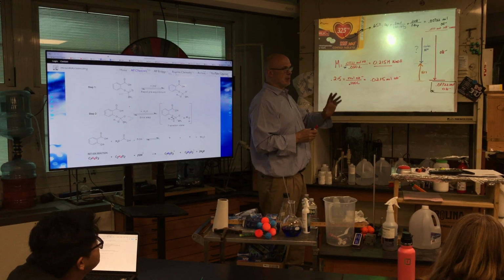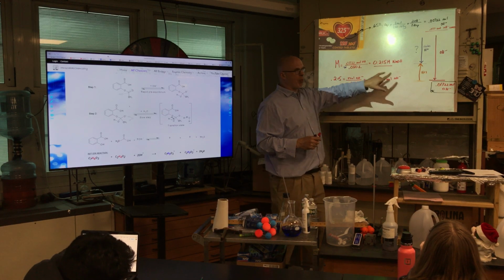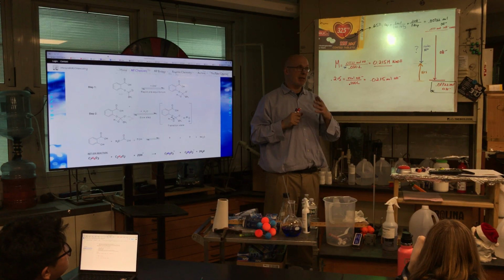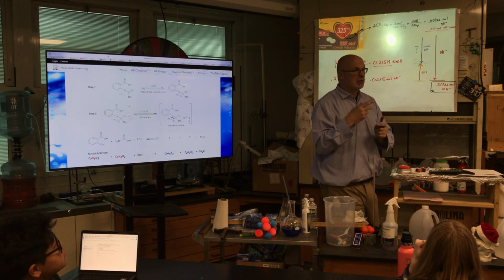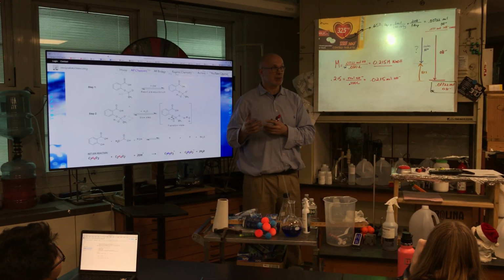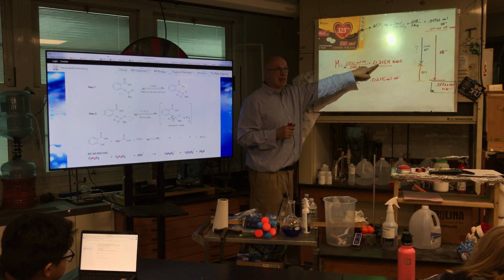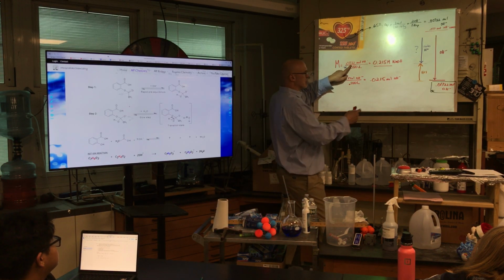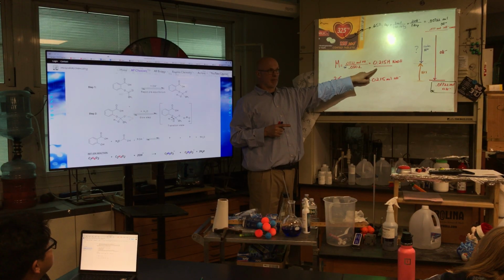I designed the molarity I need around exactly how much I want to pour into the 2 tablets. Okay? That's how I designed that. And the reason I said 80 is because I think it's a good bet. We can easily measure 80, and we can still use 20 to standardize. So I said, what would be the molarity I need to pour 80 milliliters of this target moles? And it gave me that.